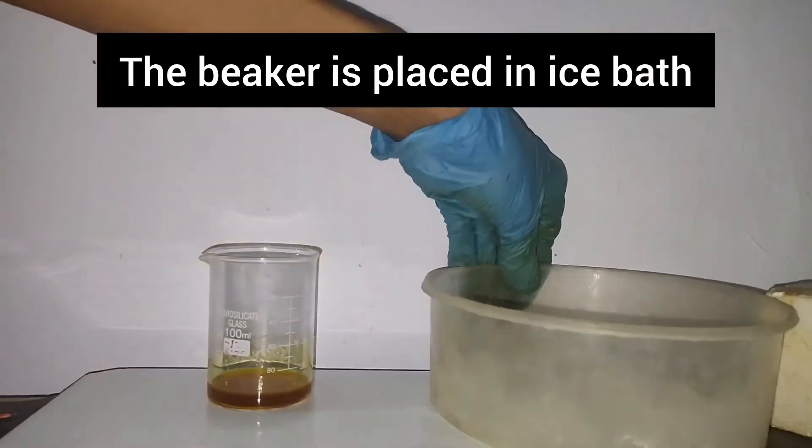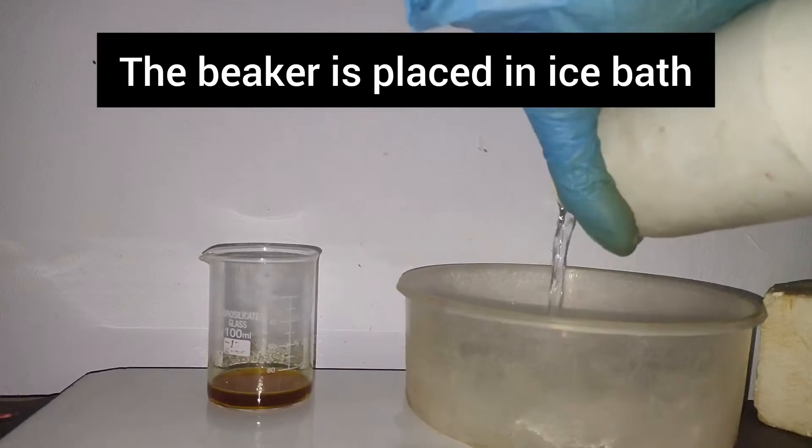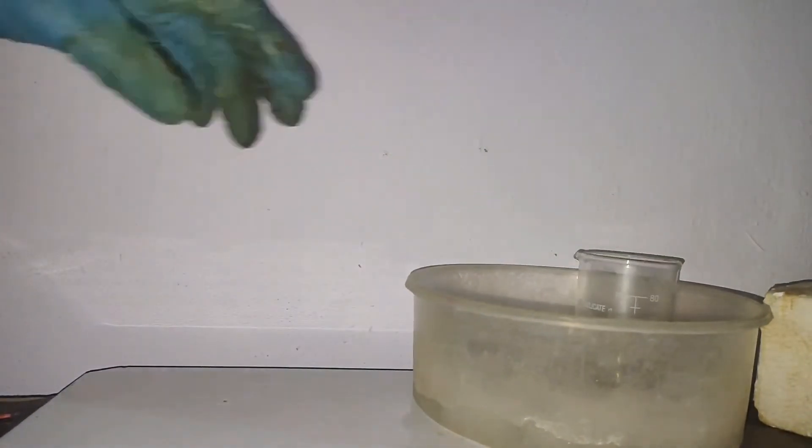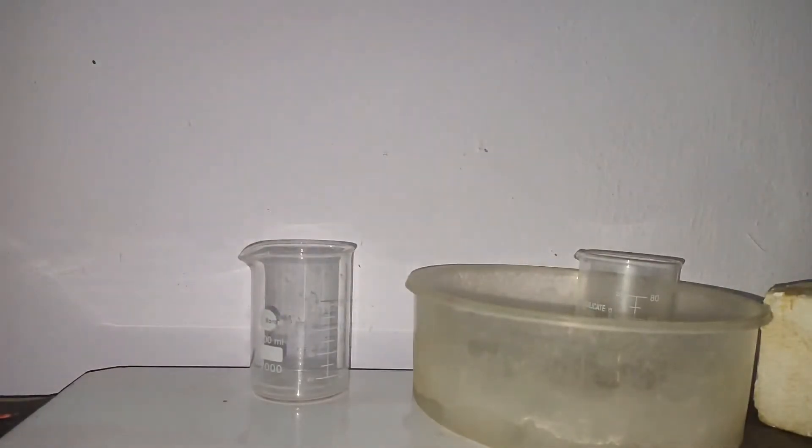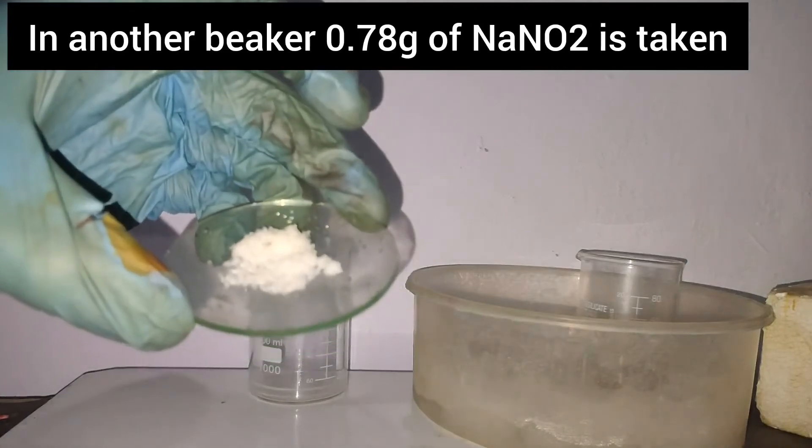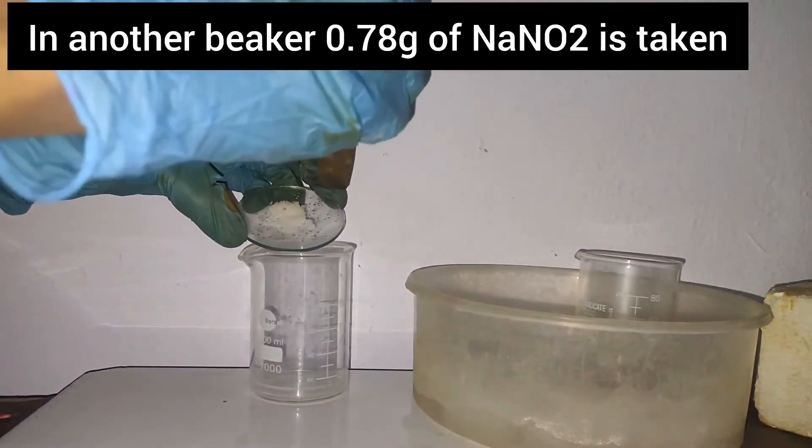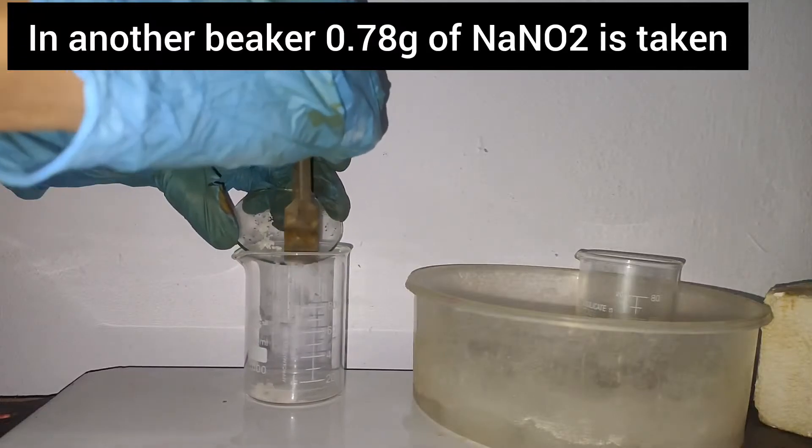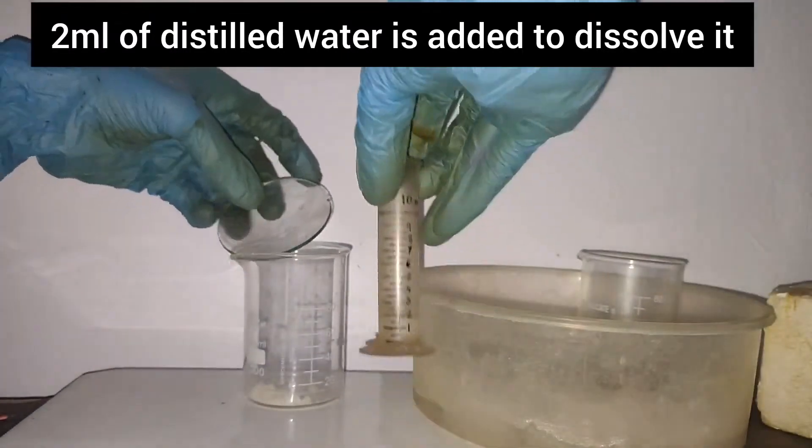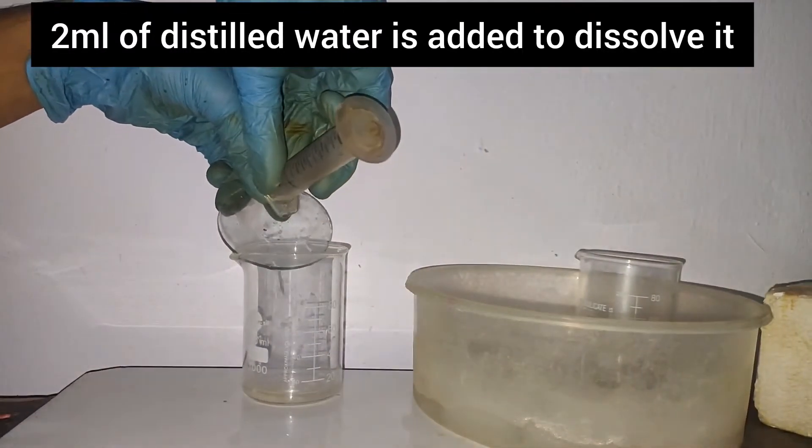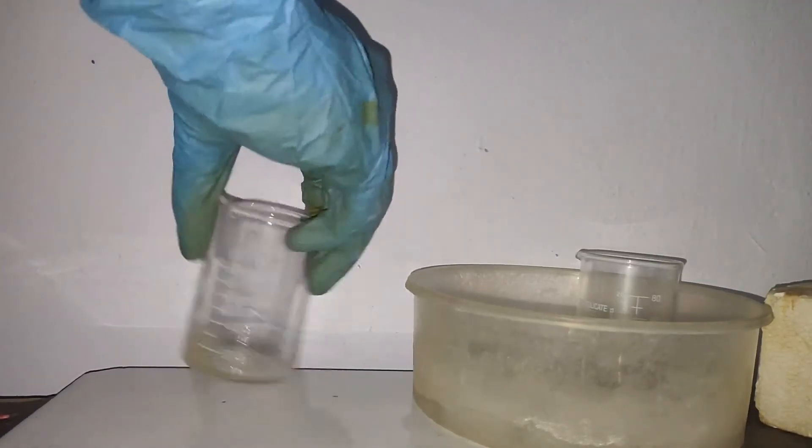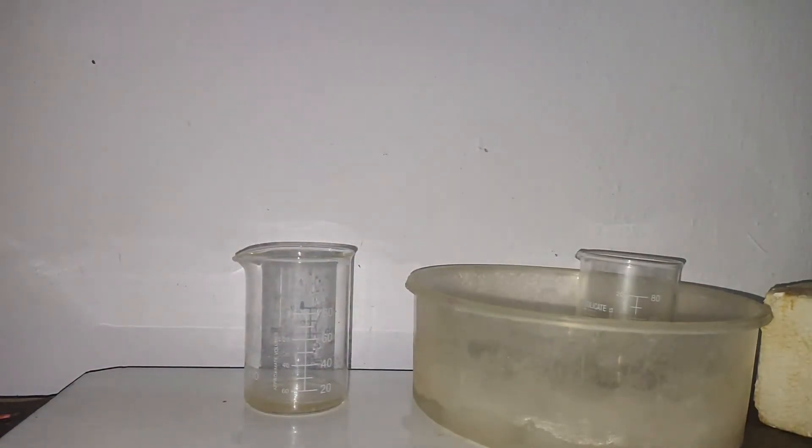This beaker was placed in an ice bath. In a second beaker, 0.78 g of sodium nitrite was taken and dissolved in 2 ml of distilled water. After dissolving, this beaker was also placed in an ice bath.